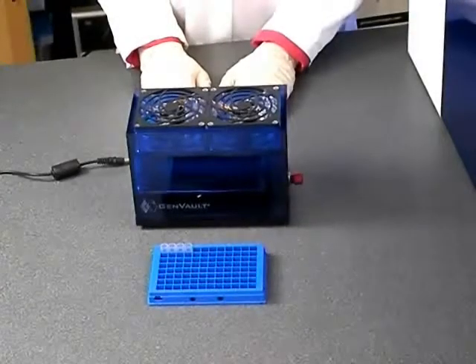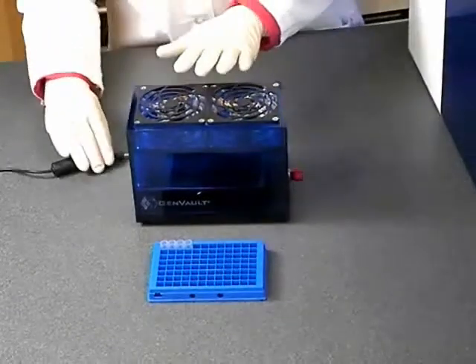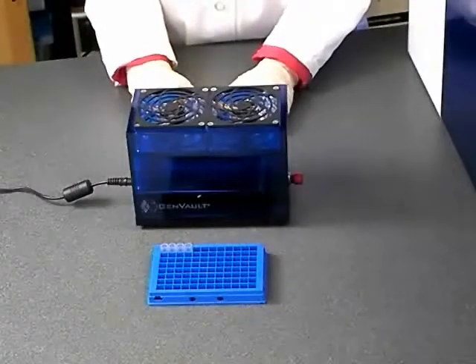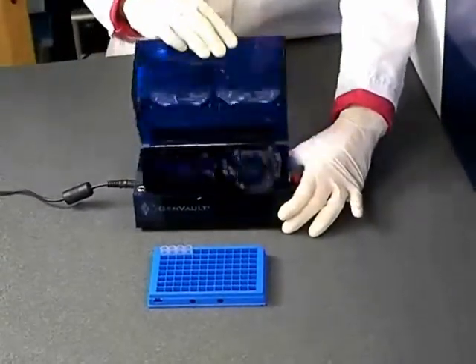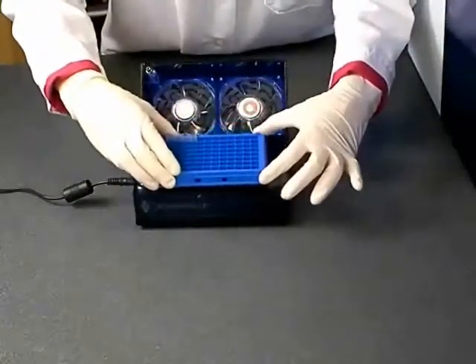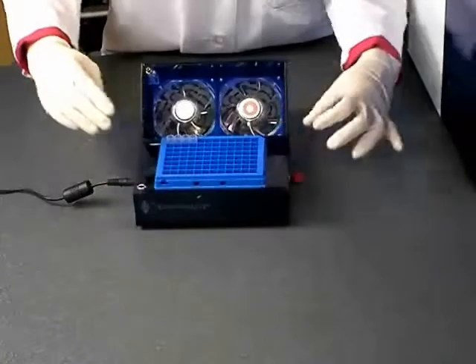Once you've applied all of your DNA samples to the Gentagra tubes, transfer your plate to the fast dryer. Ensure that the fast dryer is plugged in. Open the lid of the fast dryer and position the rack on the deck between the two positioning guides. The caps should be off the tubes for drying.